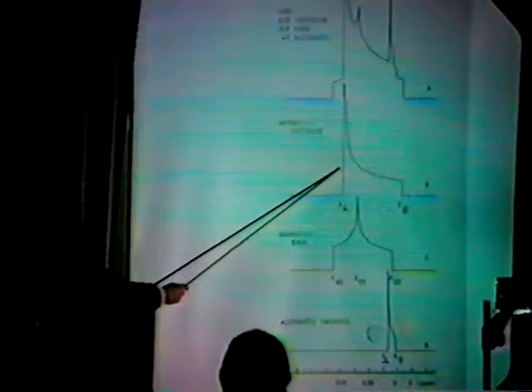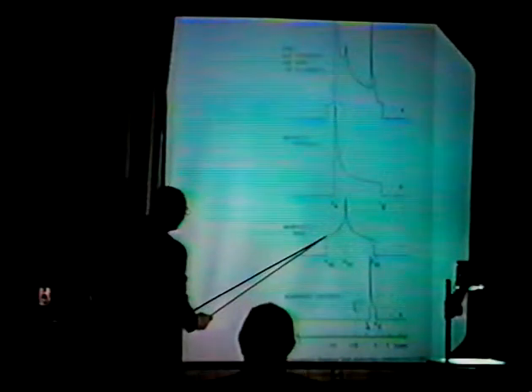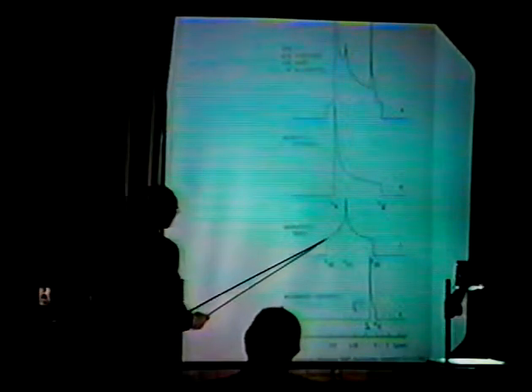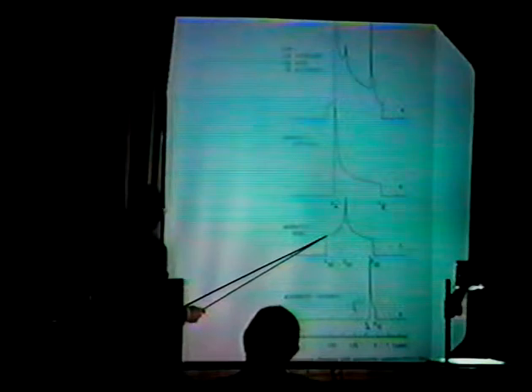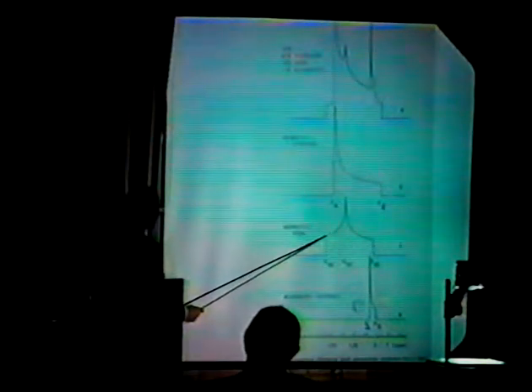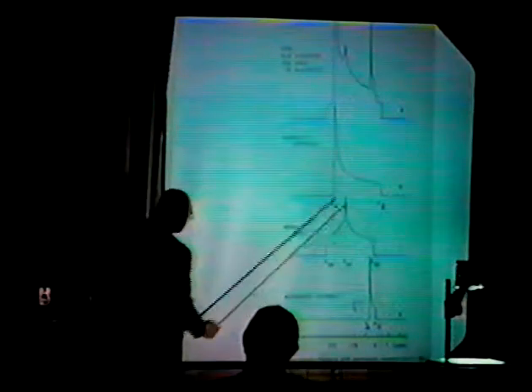So, rotating benzene looks like this. When you cool it down, it looks like this, and it no longer has the appearance of axial symmetry. In other words, a carbon atom in a benzene molecule does not have threefold symmetry, so it gives you this type of anisotropic pattern.